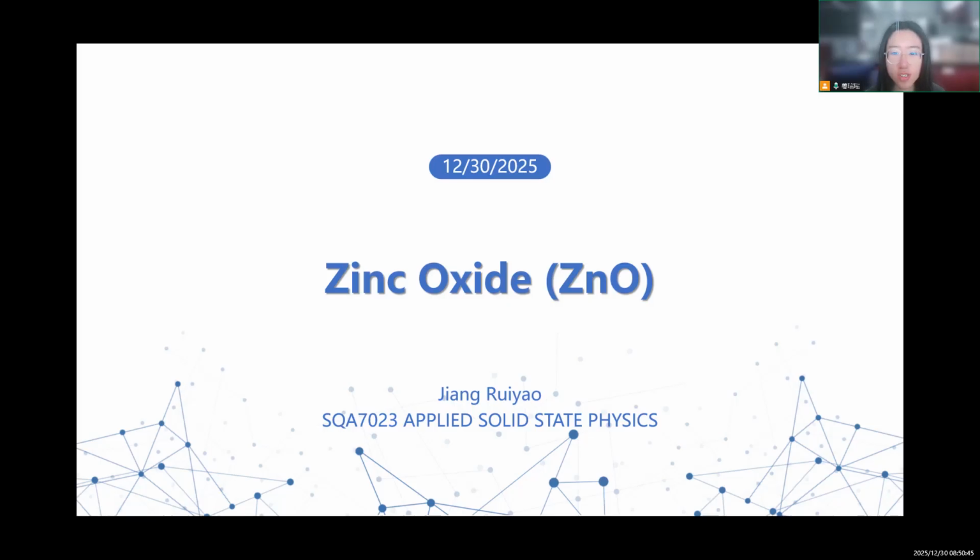This slide introduces the crystal structure of zinc oxide, its structure and optical characterization, and the relationship between characterization results. Zinc oxide is a wide bandgap semiconductor used in optoelectronic devices, ultraviolet detectors, gas sensors, photocatalysts, and other fields. Different experimental techniques will be used to demonstrate the structure, defects, and optical properties of zinc oxide.